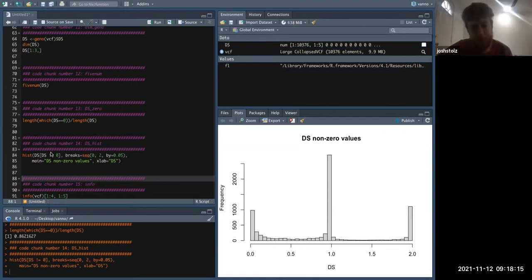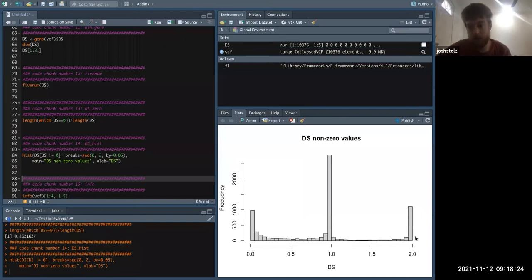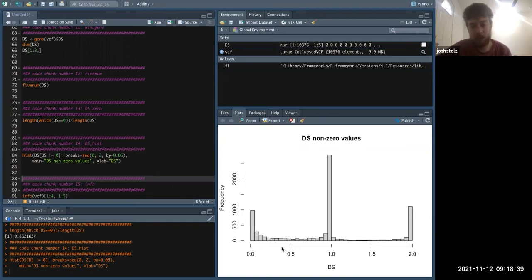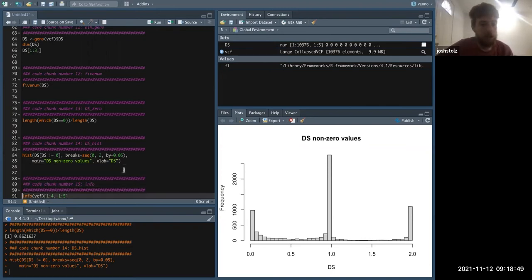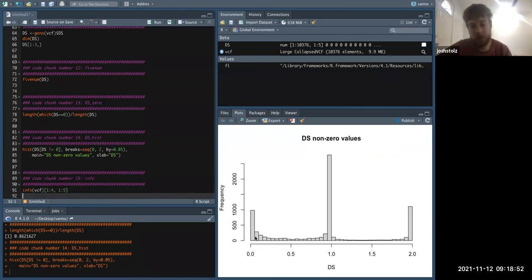We'd like to see clusters around those three options. If we make a histogram of our data — I dropped the zeros here because otherwise it would skew the entire graph — we can see that we cluster predominantly at one, two, and zero, but with a lot of spread in between. Having a call of like 0.5 isn't good; you really shouldn't have that level of uncertainty.